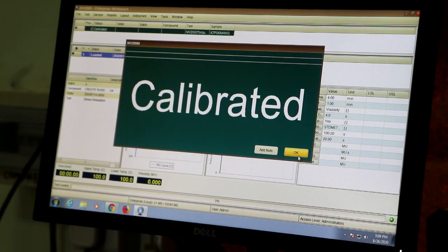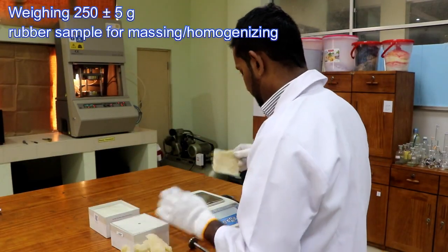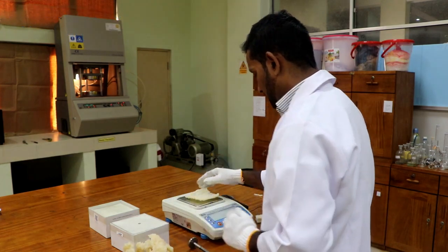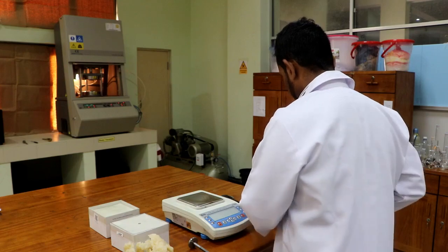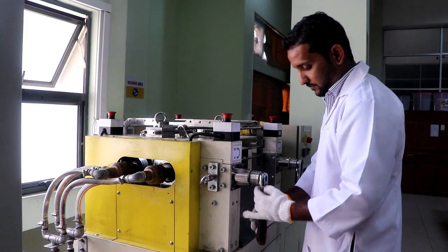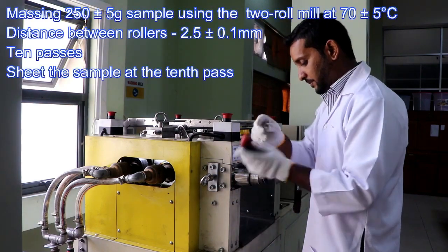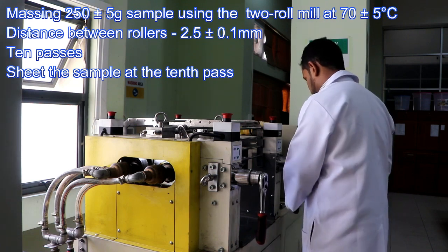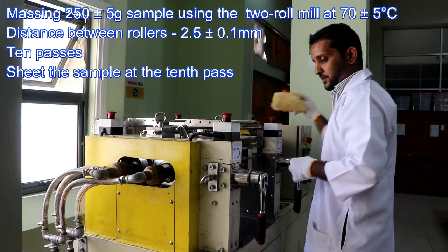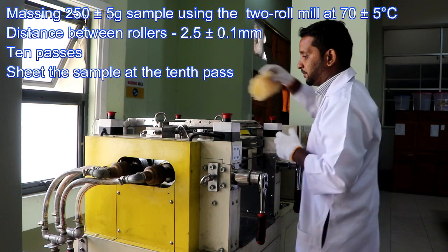Okay, today I selected a crepe rubber sample, which is a raw rubber type of natural rubber. As you got to know, the sample can be tested as received, meaning unmassed sample, or as milled sample. The sample may be massed to expel air, to consolidate particles, or to modify it if necessary. When massing, a minimum of work or shear should be done to the material during sample preparation to get the best results.